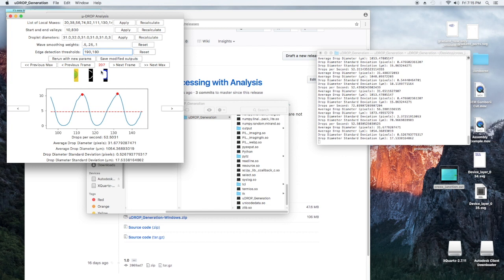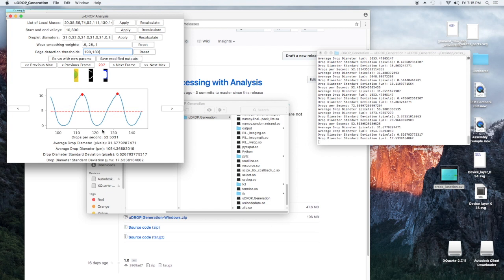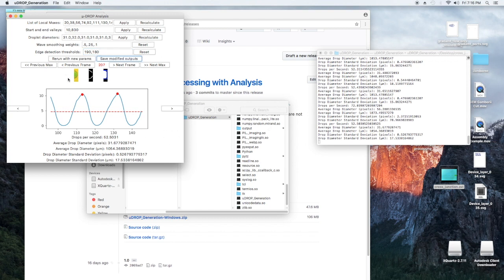So it's kind of hard to see how this affects it without playing with it a little bit. So I would encourage you to try playing with it. Anyway, that's about all there is for the end user. You can read the wiki for the actual outputs that you get from this. So these are the outputs that you get just from looking at this. But I also print out the sine waves so you can analyze this yourself using your own statistical methods. And then all the calculations. Oh, and one more important thing. After you finish editing all these values, if there's any mistakes here, make sure you save your modified outputs so that if you do additional statistical work, you're doing it on the clean data instead of the dirty data. So that's all there is for the end user.